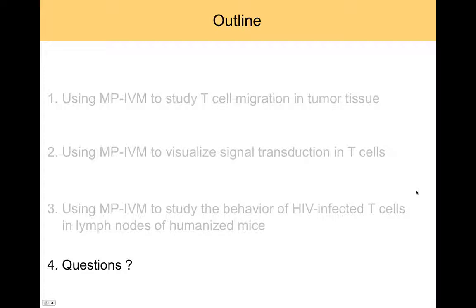So I would not say that in vitro studies generally tend to be misleading, but the way processes play out in vivo tends to be different, simply because of the much more complex tissue architecture compared to in vitro culture systems where you only have 1, 2, or maybe 3 cellular players united.